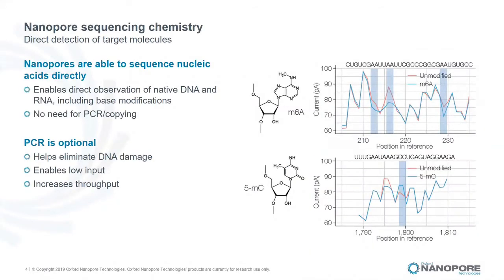So this is a brief example of how we detect modifications. Now we can detect DNA and RNA modifications. In DNA, we can detect 5-methyl-C and 6-methyl-A. We have a model and we have software. And for RNA, we can detect 5-methyl-C. We also have a model and software. So when you get the DNA sequence, the genome sequencing, you can get modification information just for free. You don't need to do an extra sequencing experiment. You can use the same squiggle information to detect those modifications.